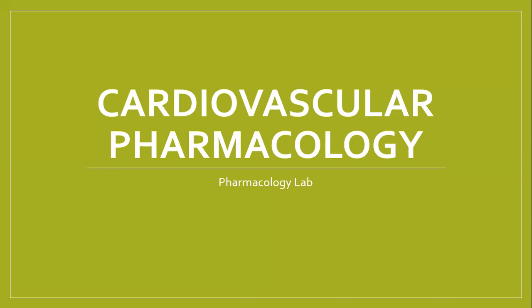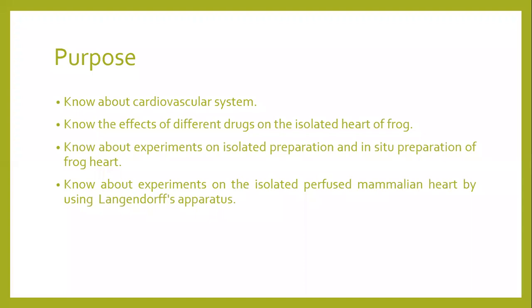Okay, so let's see what is there under this particular practical. The purpose of it is to know about the cardiovascular system, some basic concepts of the cardiovascular system.